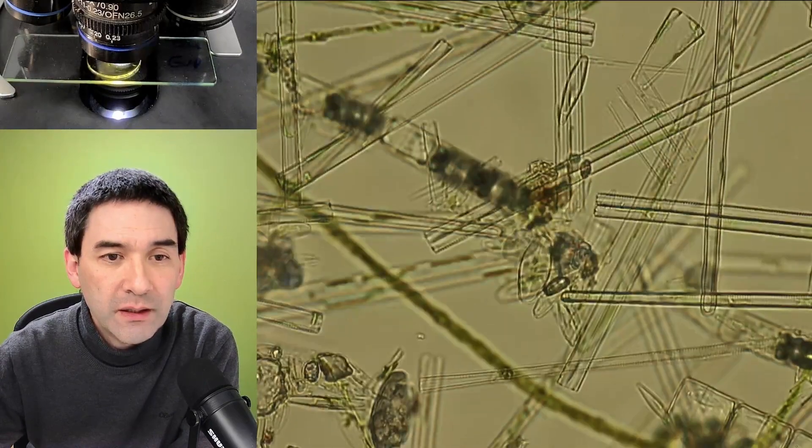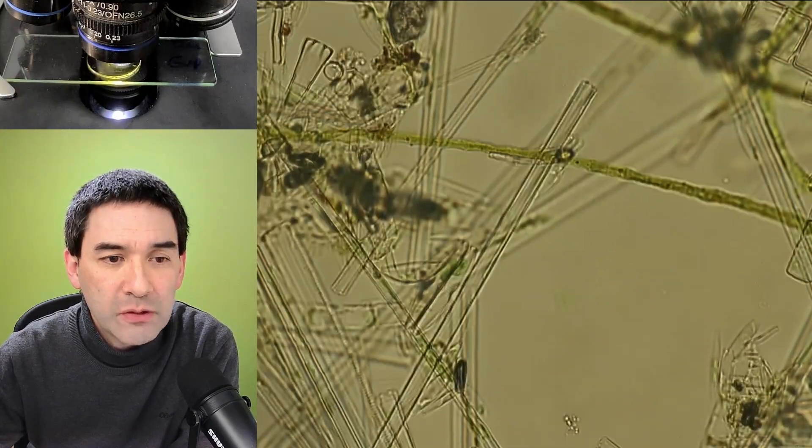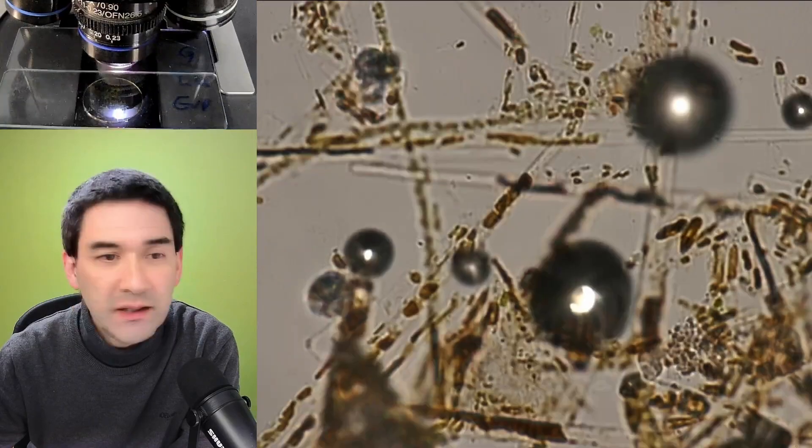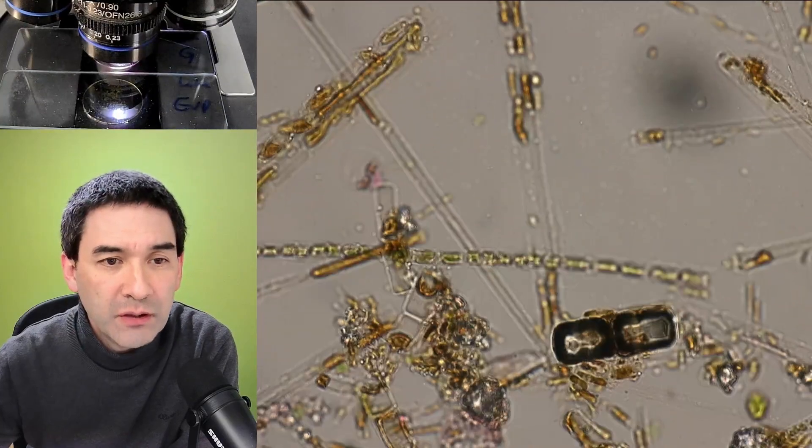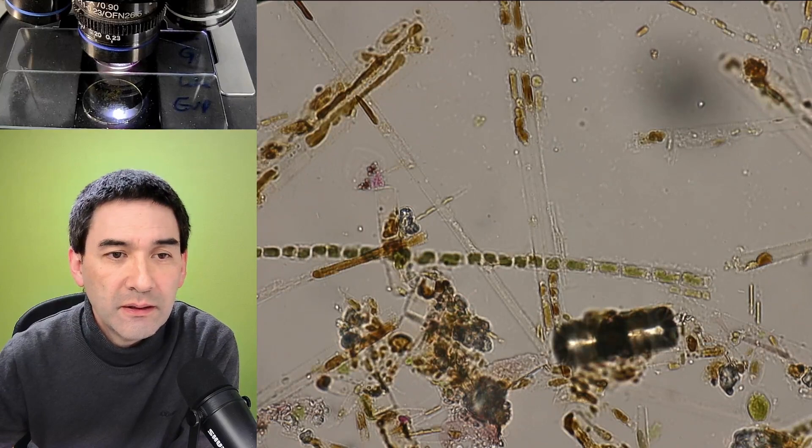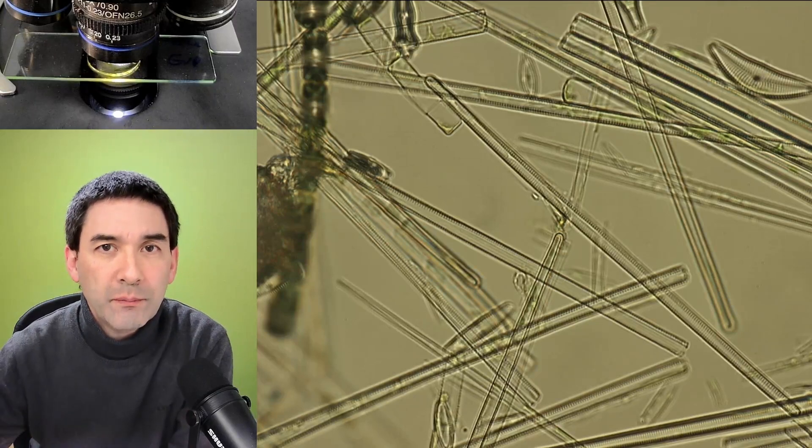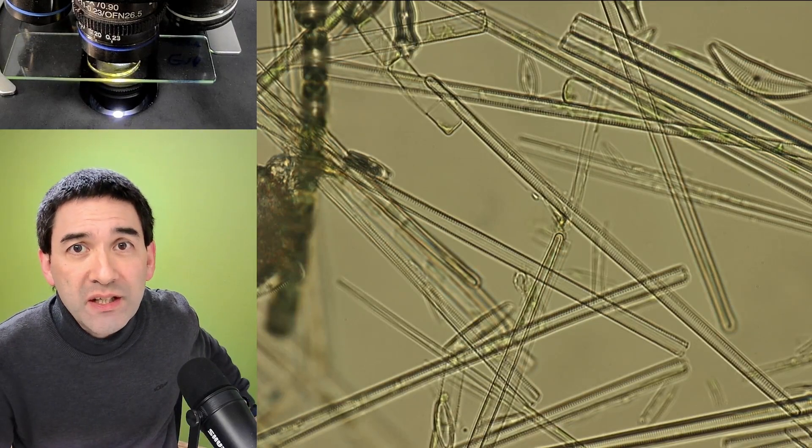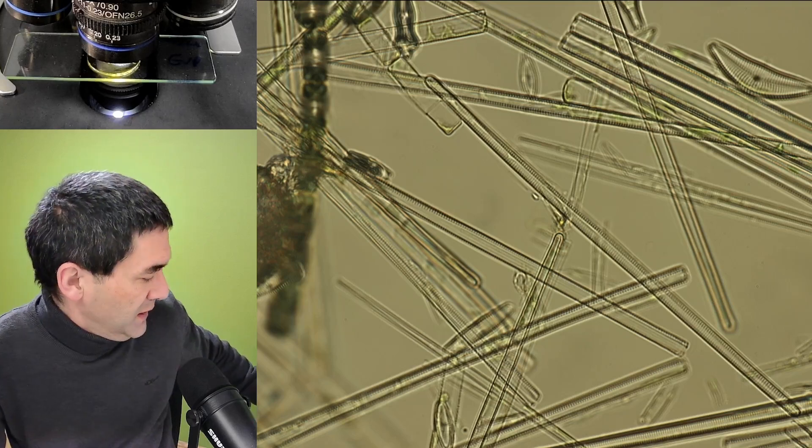Just for comparison again, this is the one mounted in glycerin gelatin, and here's Eupro mounting medium again. One of the most notable things is of course that we're not able to see now the individual chloroplasts. Let me switch on the arrow again.